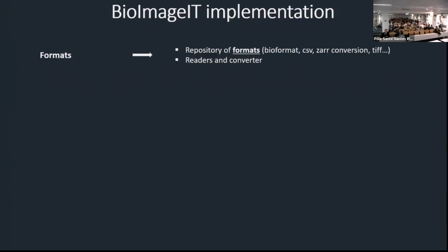You can also generate CSV if you have analyzed some things on your images. If you want to read proprietary formats, we can use Bio-Formats.